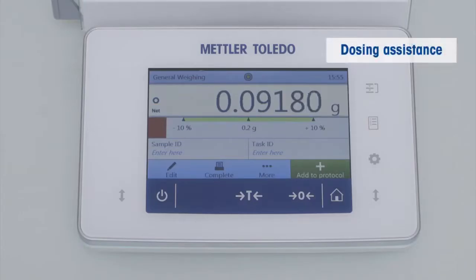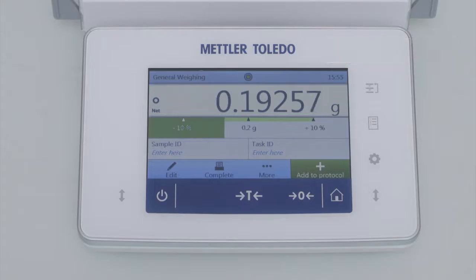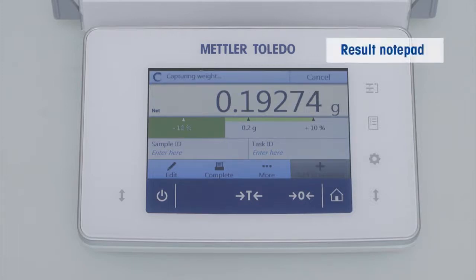The dosing guide helps you to ensure the exact amount within a defined tolerance indicated by the green bar on the display. After dosing in the desired amount we simply push the add to protocol button to transfer the results to the result notepad on the right side of the display.